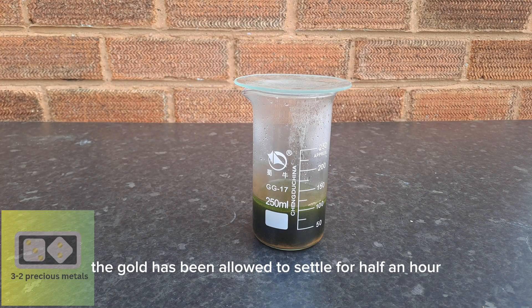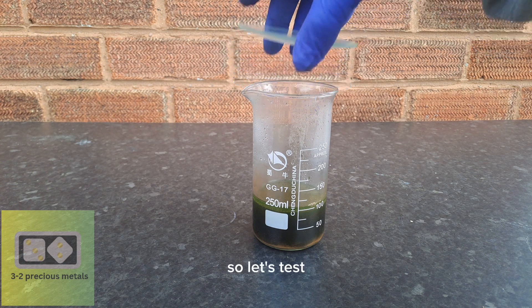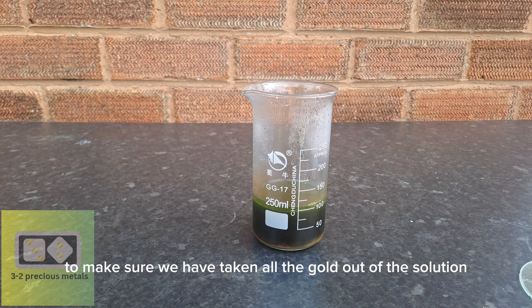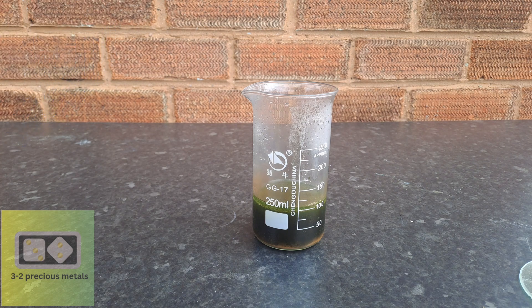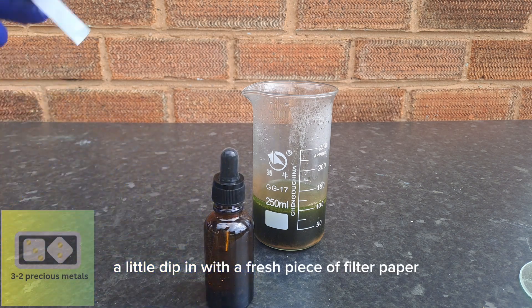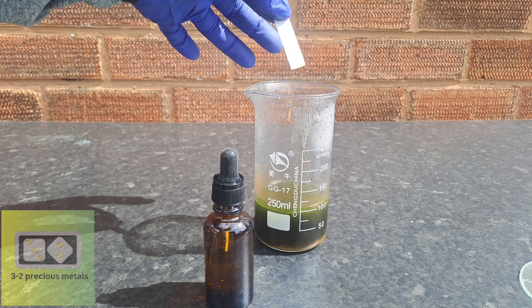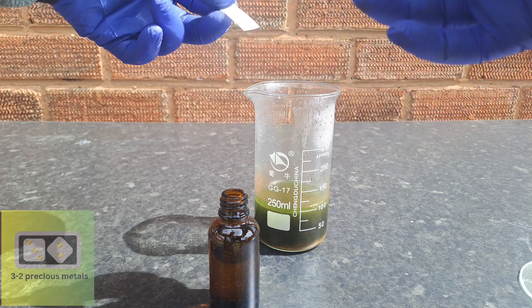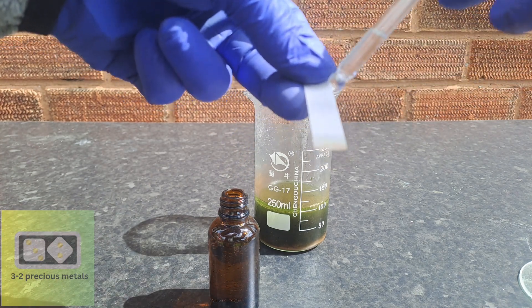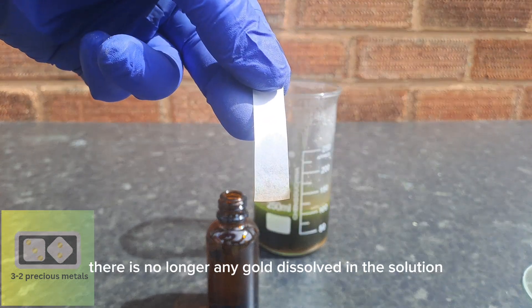The gold has been allowed to settle for half an hour and another cup of tea has been drunk. Let's test to make sure we have taken all the gold out of the solution. A little dip in with a fresh piece of filter paper — and as you can see, no reaction. There is no longer any gold dissolved in the solution.